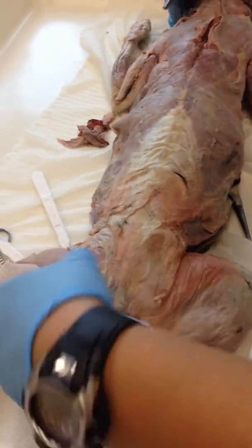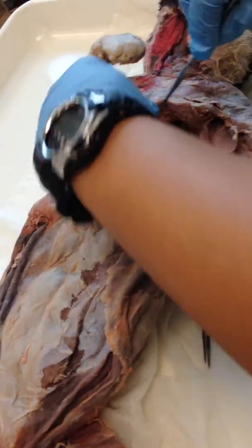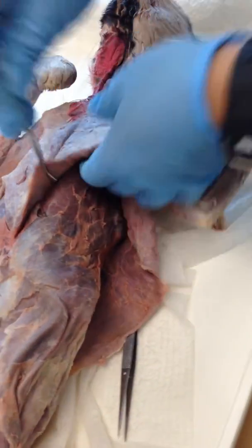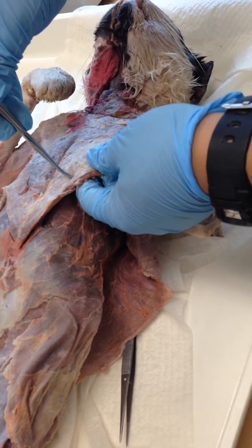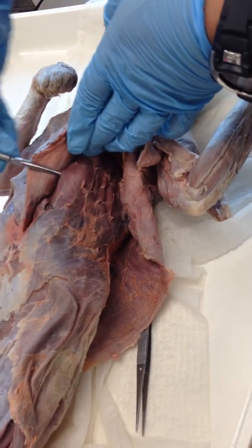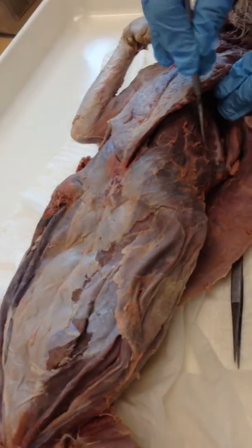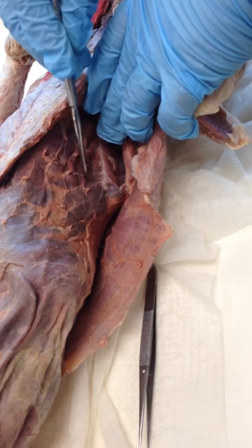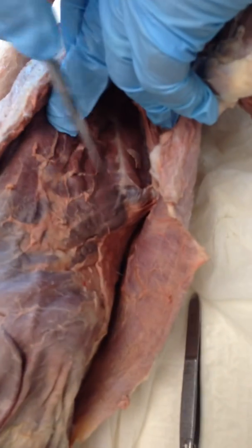Now we're going to go to the anterior. We're going to look at the pectorals, where I'm making this flap right here. This is the pectoralis minor. Underneath that, that's your big pectoralis right there. The next one would be serratus ventralis, which is this one right here, this muscle that's going diagonal this way.